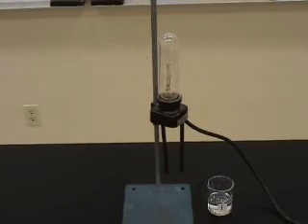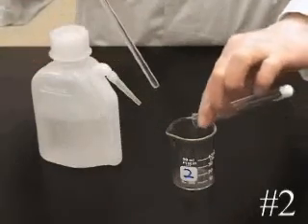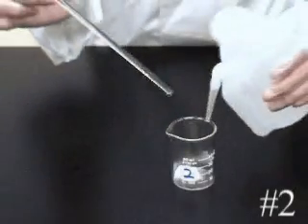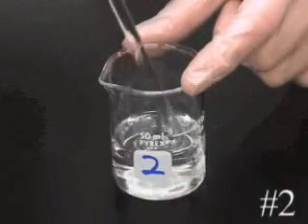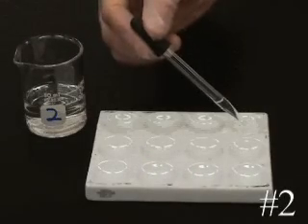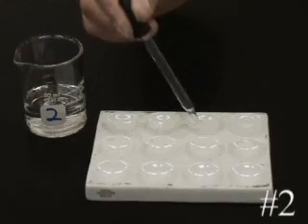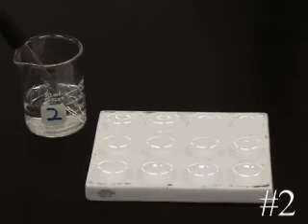We will now repeat those tests for solution number 2. Again, we will first make the solution. Again, place a sample of the solution in each of 2 sections of the drop plate. As before, test the solution with litmus paper.